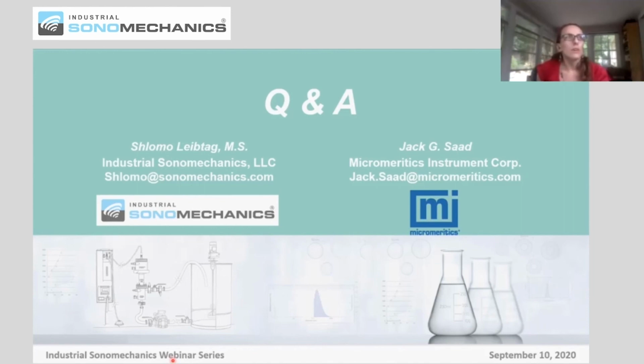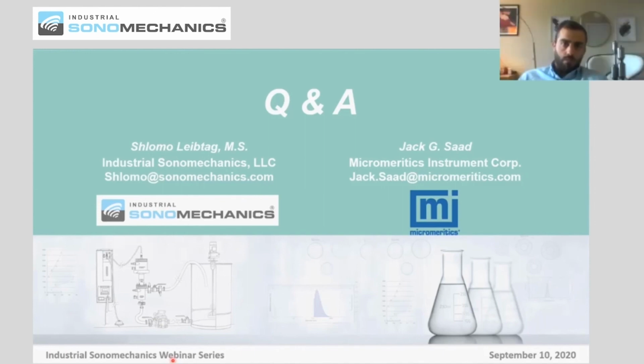Another question is, if you were to run a 2-to-1 nanoemulsifier to product or oil, active ingredient, I assume is what they mean, and decided you wanted to be more transparent, can you rerun the material through the ultrasonic processor with more nanoemulsifier to increase the ratio? Yeah, as long as you know the components in it, so you're sure that you were 2-to-1 before, and you had the proper amount to make it up to 5-to-1, then yeah, you should make a translucent nanoemulsion.